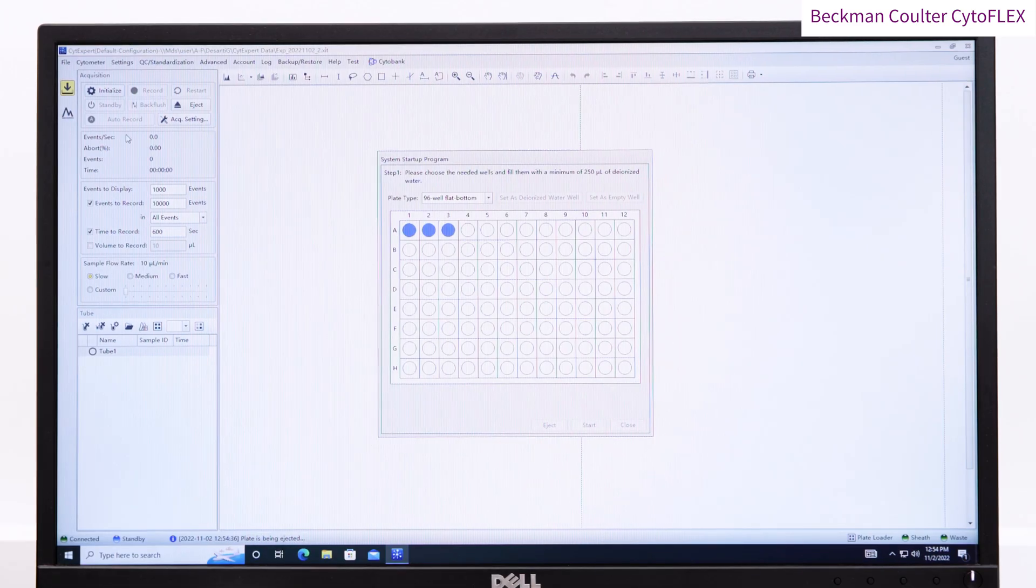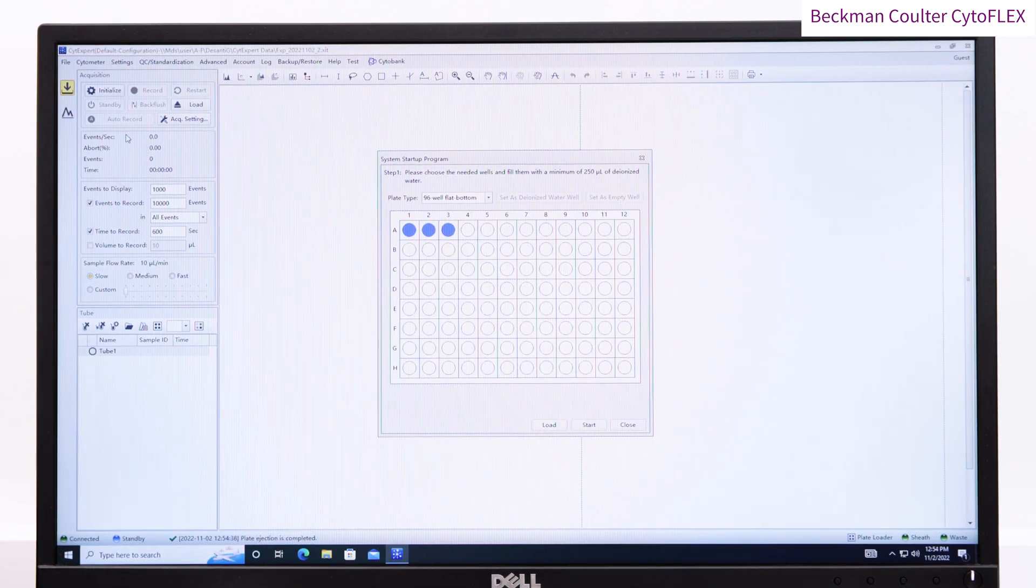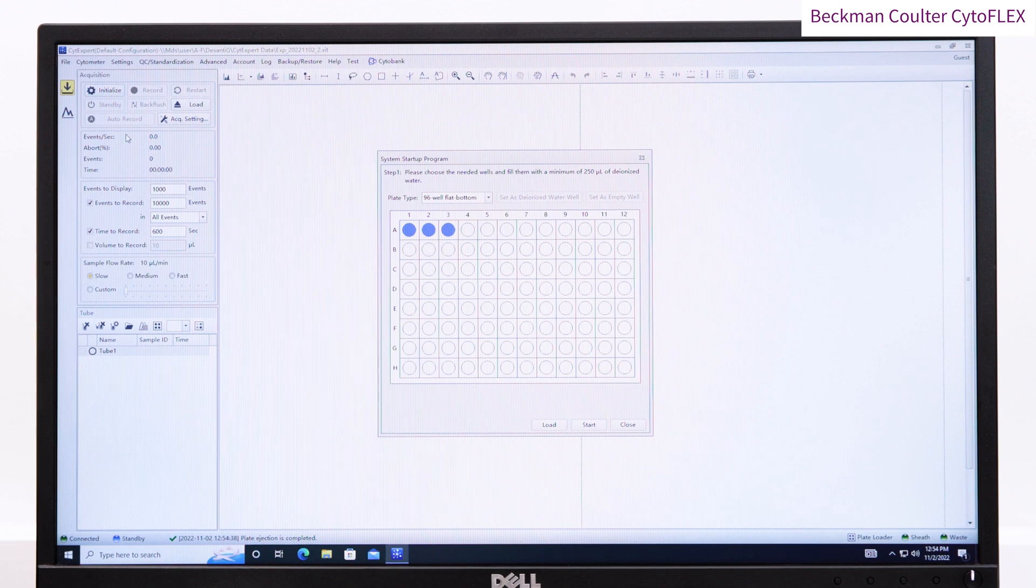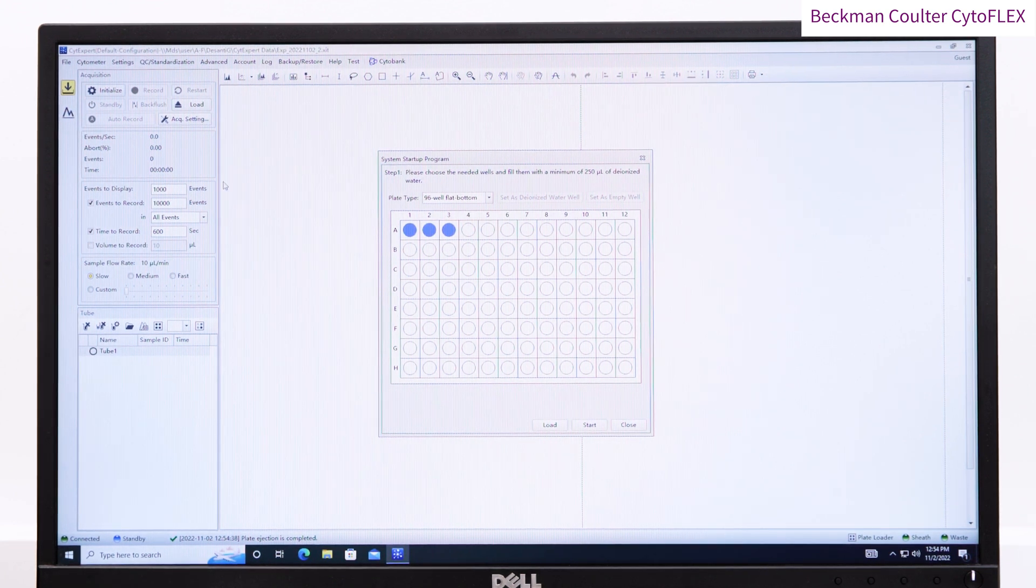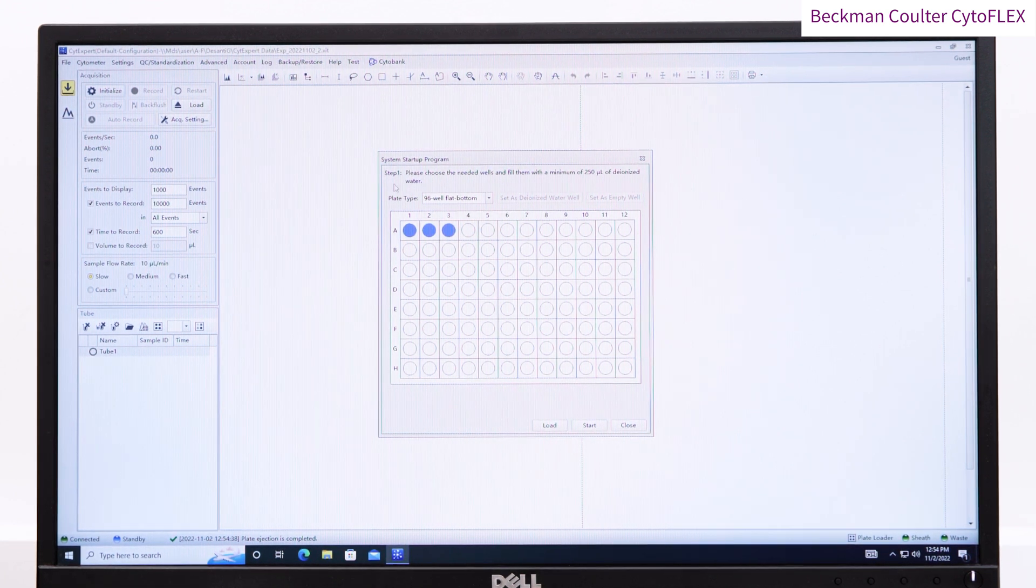When using plates, you can define which wells contain deionized water, and press start. It will take roughly eight minutes to run the startup program.